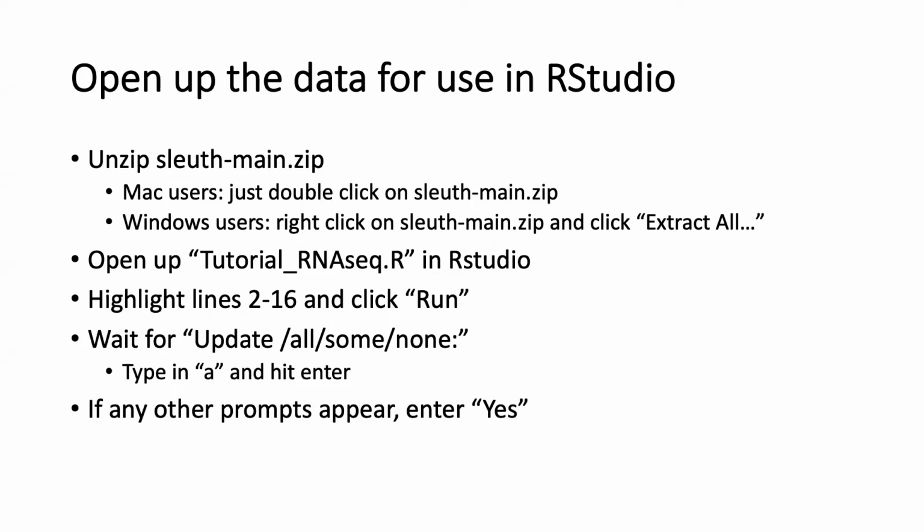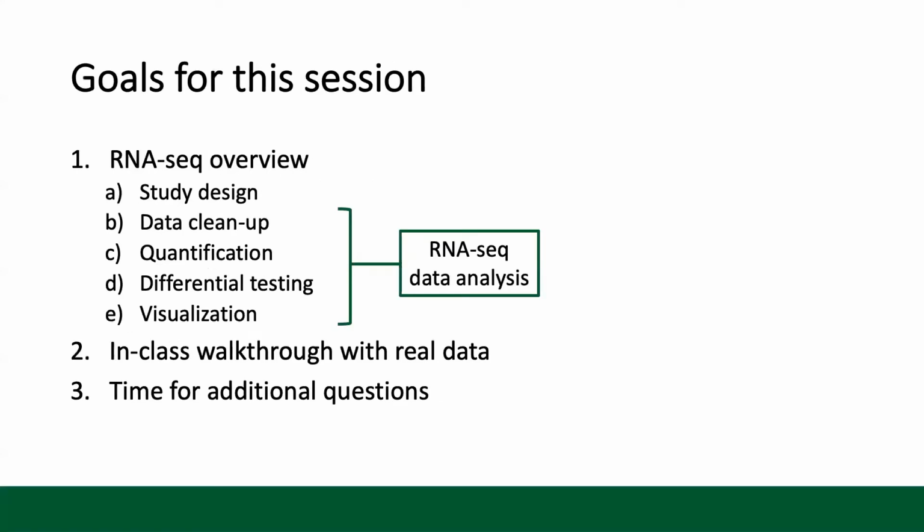Okay, and with that, I will start in with the rest of the talk. So the goals for this section are to give you a nice background on basic RNA-seq analysis, starting with study design and then moving into the RNA-seq data analysis, which includes data cleanup, quantification, differential testing, and visualization. As part of that later part of this data analysis section, I'm going to try and lead an in-class walkthrough with real data. And then we'll probably have plenty of time for additional questions at the end.